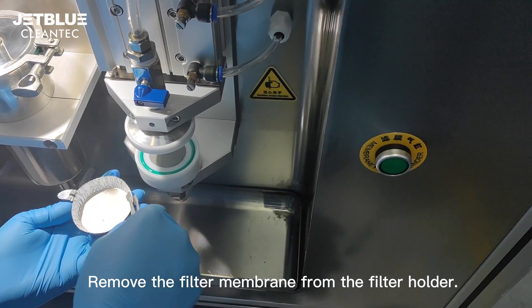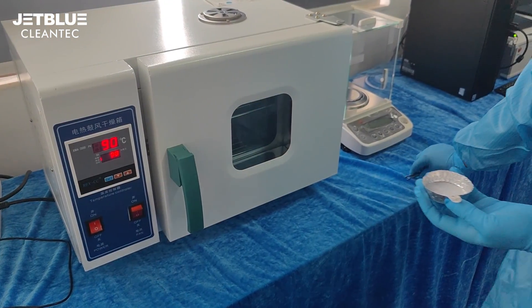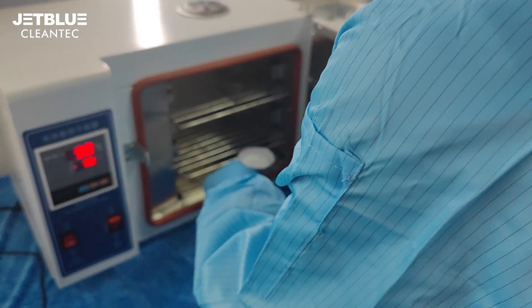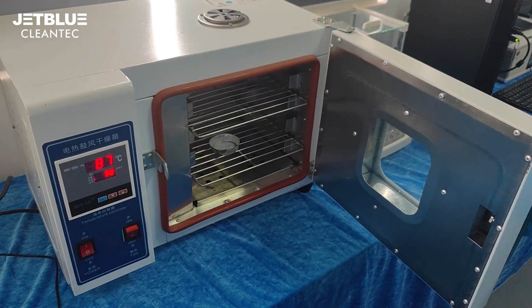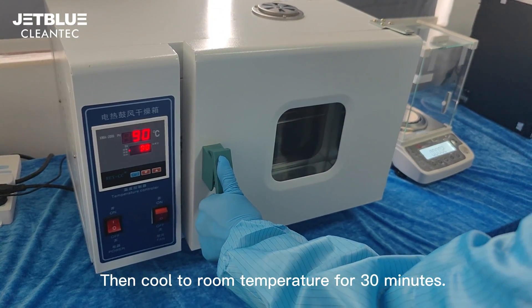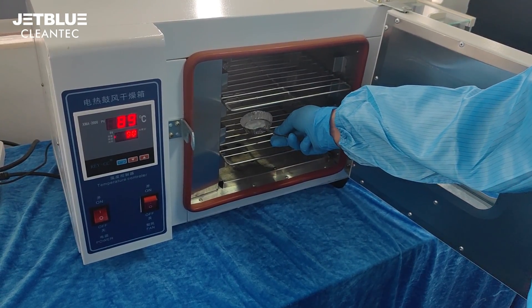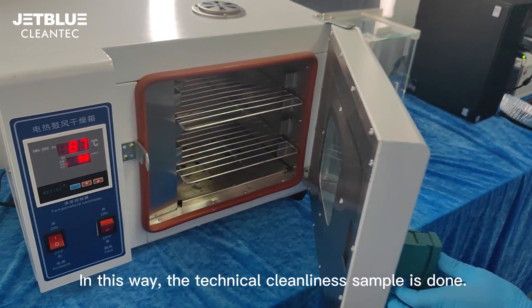Remove the filter membrane from the filter holder and place it in the drying oven to dry. Then cool to room temperature for 30 minutes. In this way, the technical cleanliness sample preparation is complete.